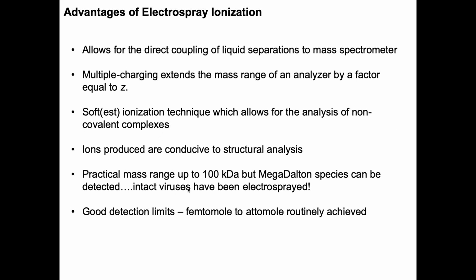So there is no foreseeable upper limit in terms of what you can actually get into a mass spec, which is phenomenal. You could electrospray a virus. Good detection limits of femtomoles, attomoles. 100 attomoles is routine for most things.